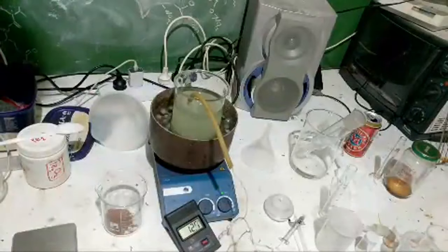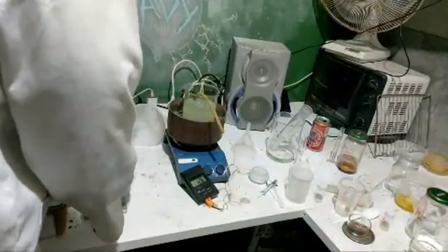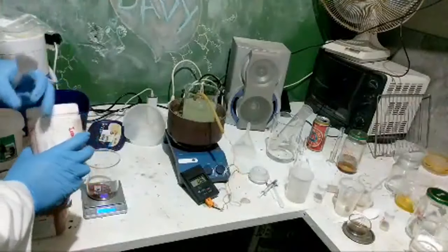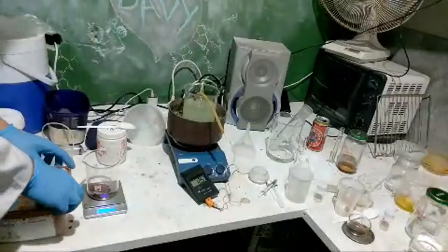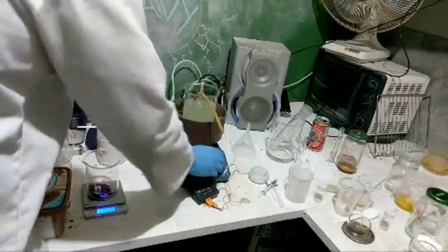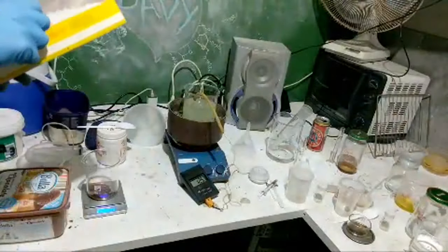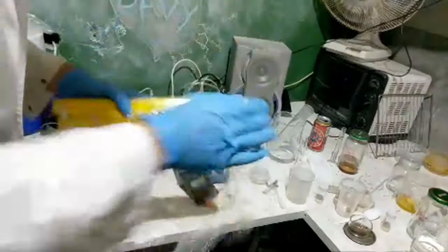I suppose, actually, I've changed my mind. It doesn't matter how much iron oxide we use because we're going to have to filter anyway. So let's put another 2 grams in. No, I shouldn't. That's fine. I'm going to restrain myself. All right, hopefully that cools down. Bugs can fuck off. I'm going to put some glad wrap, some plastic wrap, over the top of this, because otherwise a moth is going to fly in there. I can just see that happening.